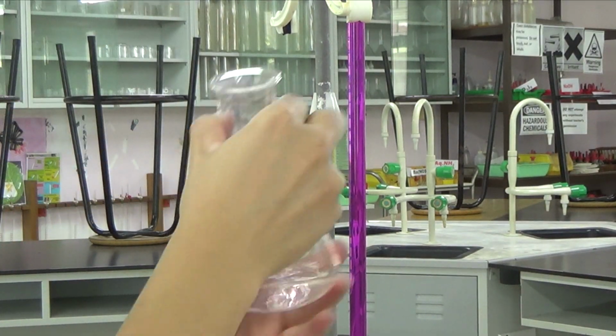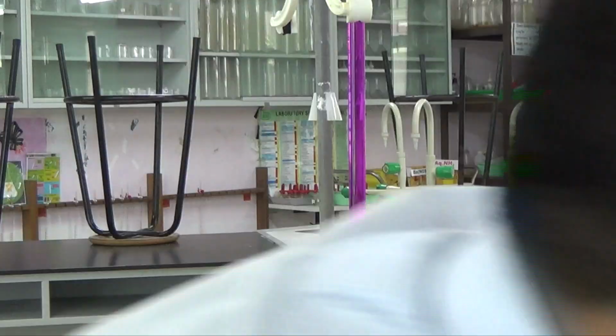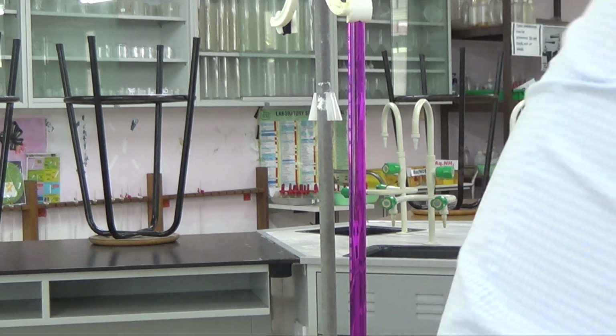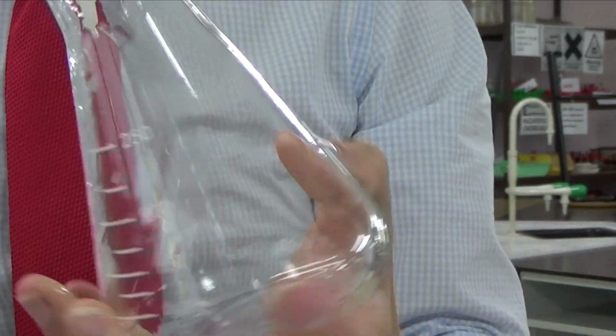I have run out of conical flask, so I will just put this away. No, actually, I'm going to keep this. This was in large excess. I'm going to throw it away. Rinse it with some tap water. So after you rinse with tap water, I'm just going to rinse it with some distilled water, and then throw it away. I rinse a second time with distilled water.